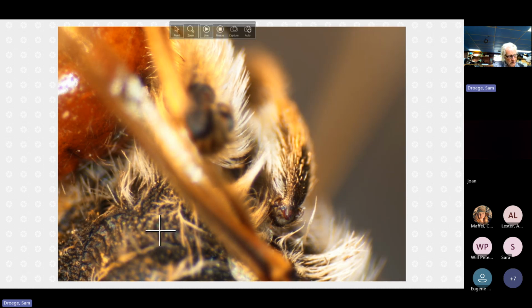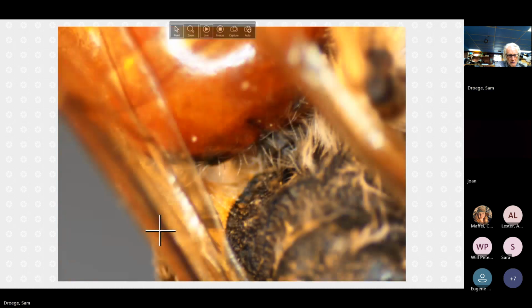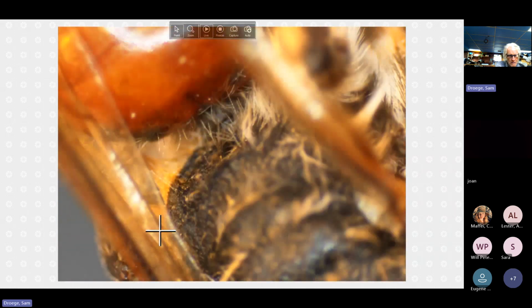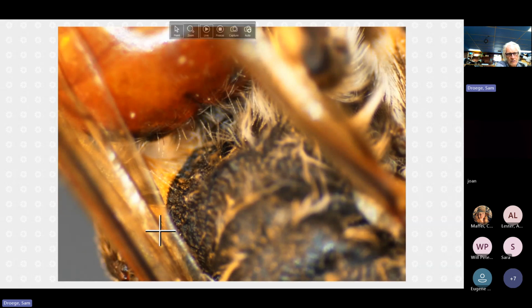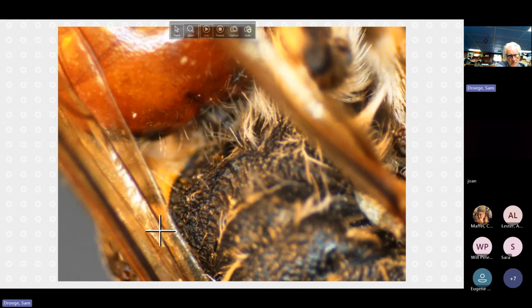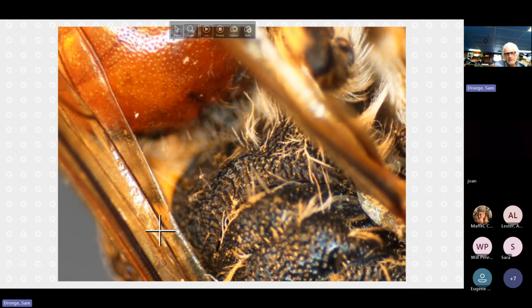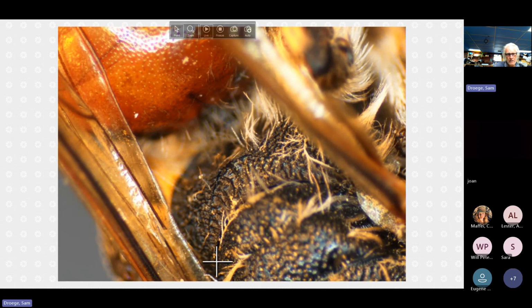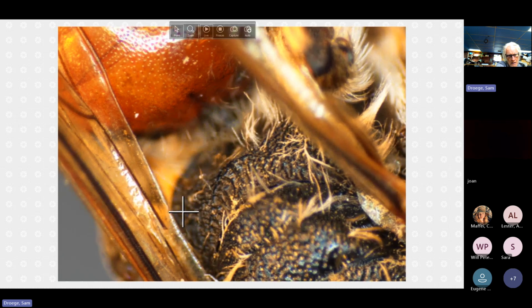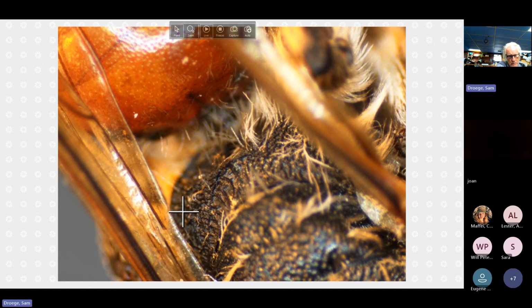But if we look over in this direction, it seems to be more the case. Again, looking at these things under the microscope can be misleading. So I can see the point there. So I can see the boundary. This looks pretty similar out here, but it might again be easier to see if I was looking under the microscope.